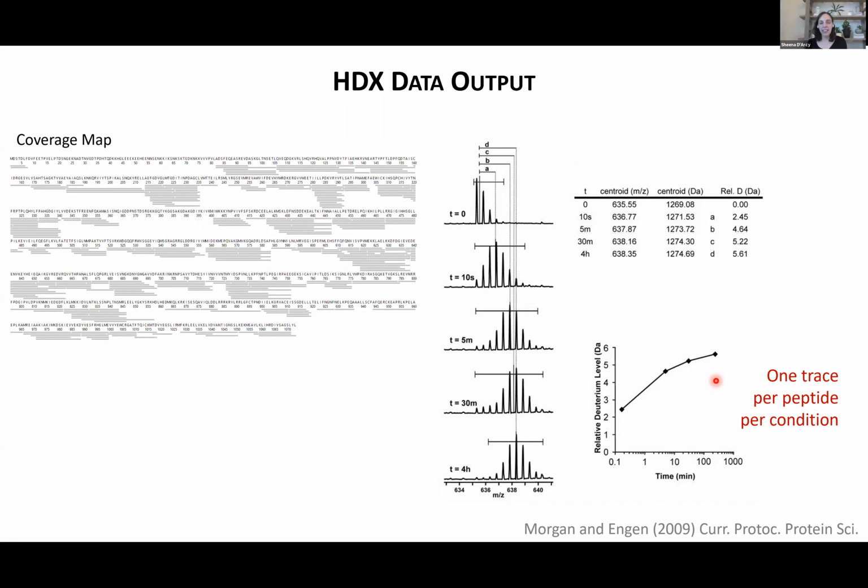So here's an example. I think this is about 1/3 of the peptides from a particular experiment. We have the green condition and the blue condition. And we're asking in which parts of the protein does our condition cause a change? And you can straight away identify here some parts of the protein where the blue and the green traces do not overlay. Now, I'm not going to talk about it today, but we can also just look at a single trace and comment on the stability or the secondary structure of that part of the protein. But like I said, that's not what I'm going to focus on today.